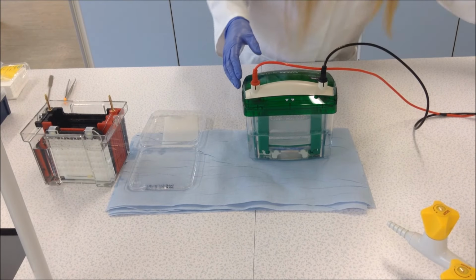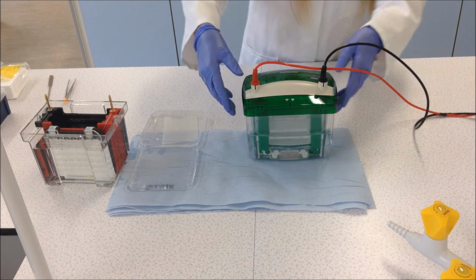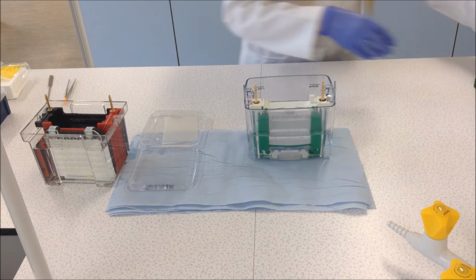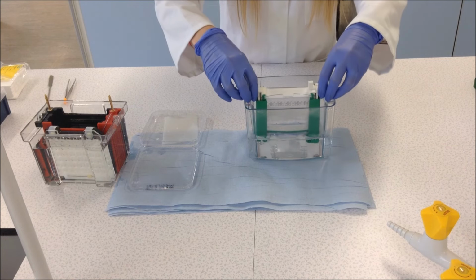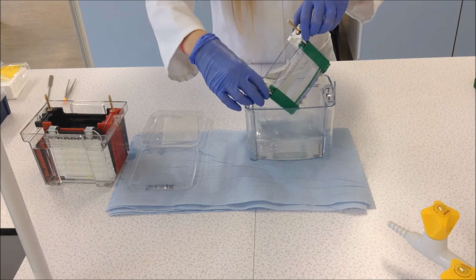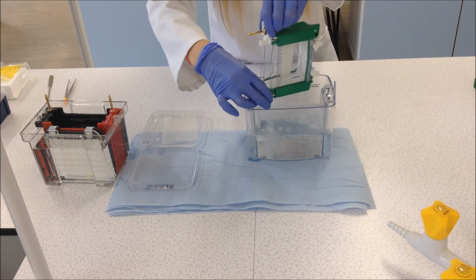For the first step, you're going to need your polyacrylamide gel that you allowed to go under electrophoresis, ensuring that the power supply is turned off. You can then remove the lid and remove the cassette from within the chamber, remembering that there is running buffer within the reservoir, so make sure you pour this out before you move the cassette.